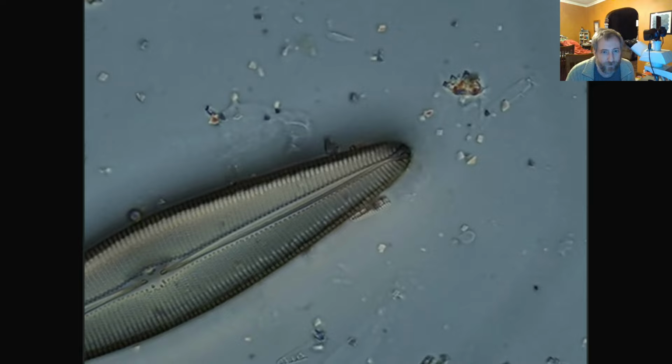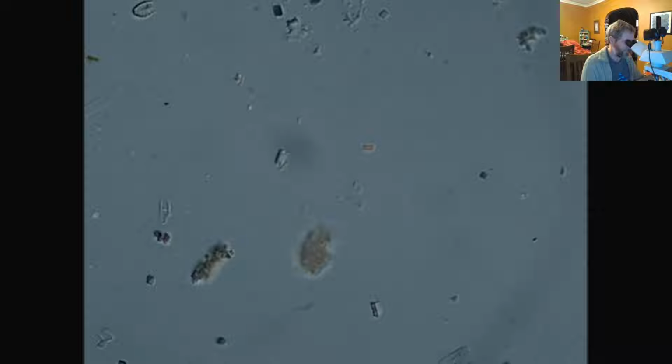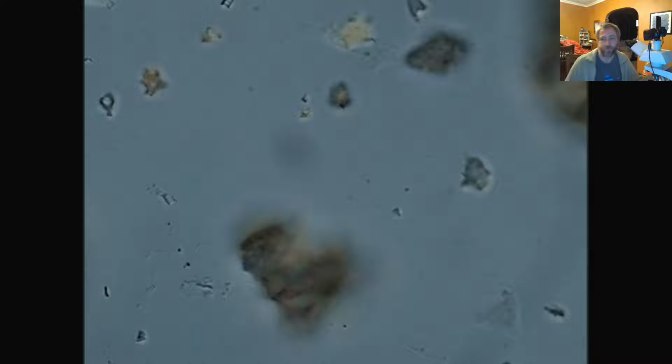Right, so this is our horned beast gomphoneme, and like I mentioned, this is probably a new species or maybe a variety of mamilla. So we'll probably end up describing that guy. I'm excited that I bumbled into it. I didn't have it marked anywhere on the slide, so I just randomly came across that one. Some plant cells, another cocconeis. And yeah, that's all. I think that's all the cool stuff that I have in the slide, actually. I think we've seen everything.